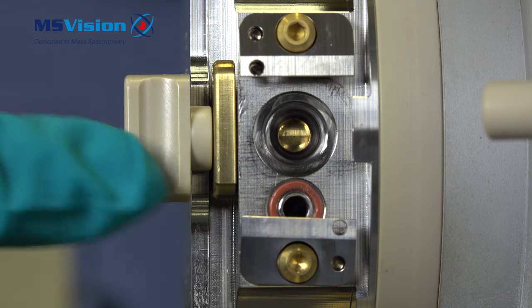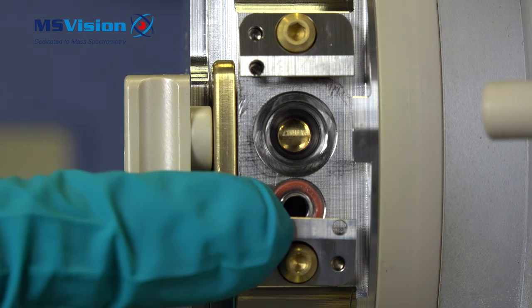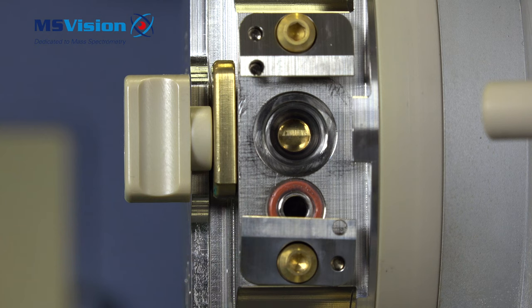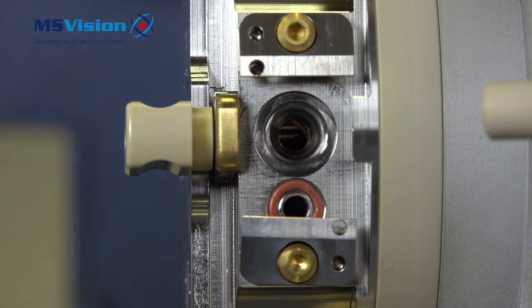You can see the isolation valve here is closed. This closes off the vacuum so that you can remove the cone after cleaning without venting the system. In this position you can see it's fully open.